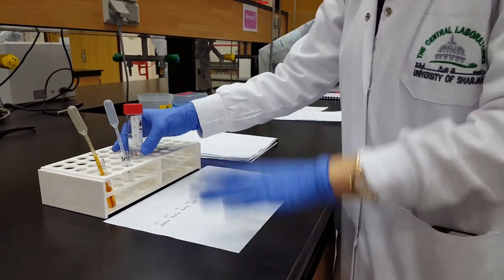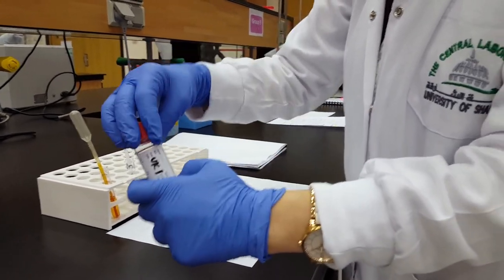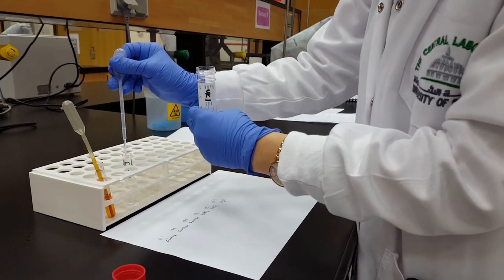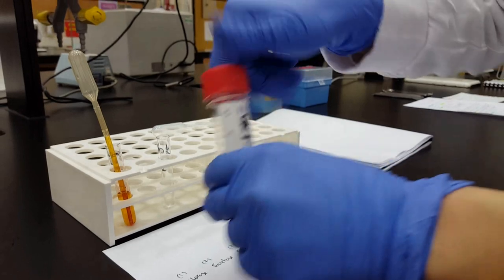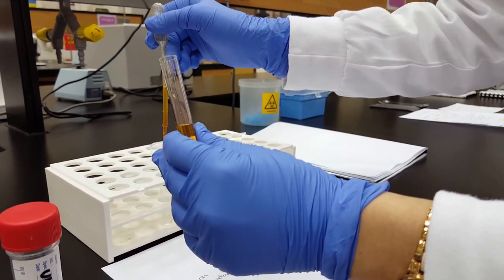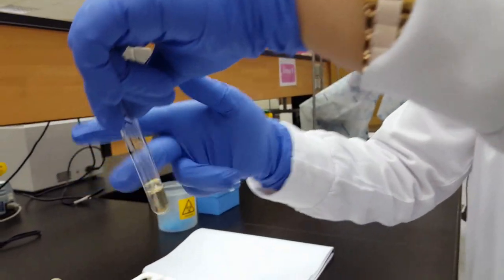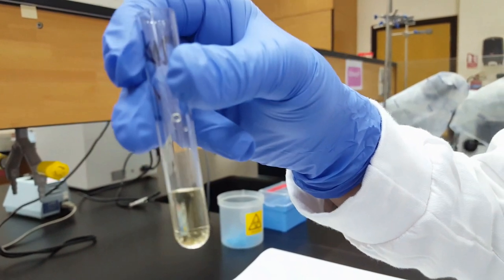To test specifically for polysaccharide, we add 1 ml of the unknown to a test tube. So here's the 1 ml, and we add it to this test tube, and then add 2 drops of iodine. So what happens? Let's see. Then mix it. And as you can see, there is no purple color, which indicates it's negative for polysaccharide.